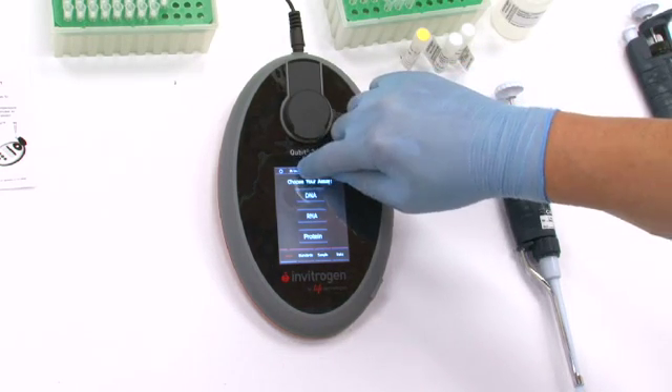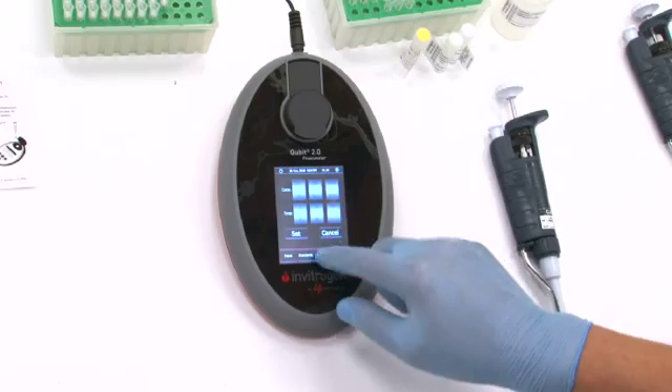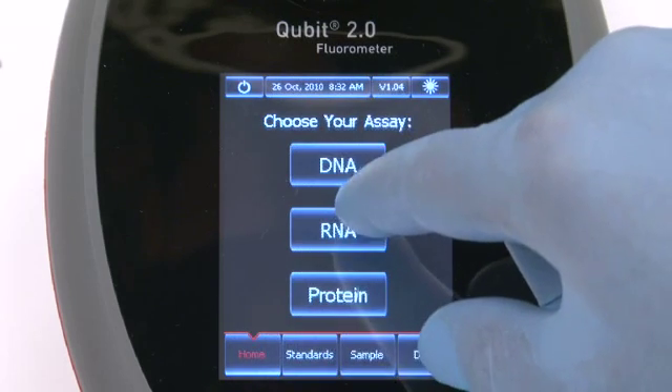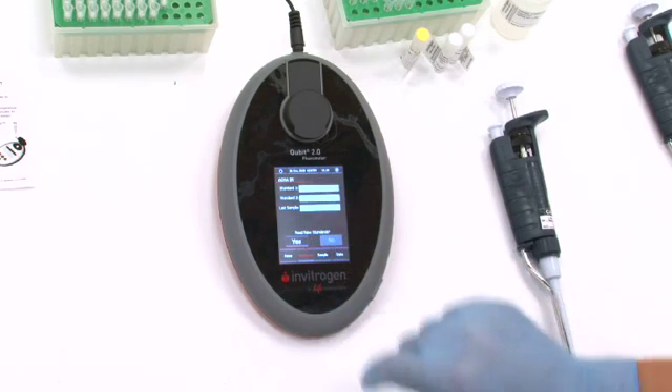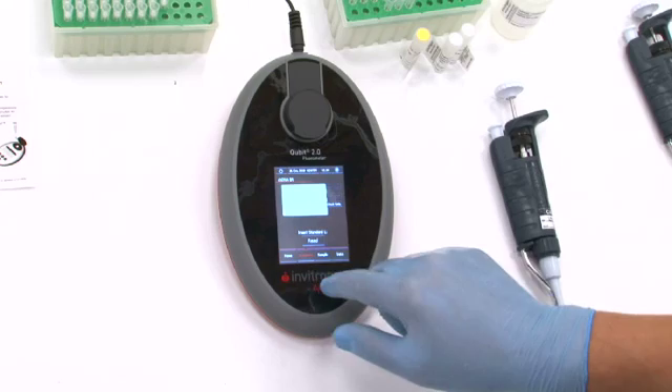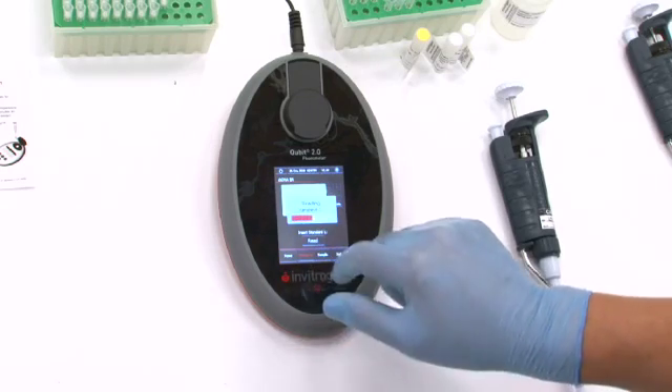Qubit 2 is simply the most specific and sensitive device amongst all nucleic acid and protein quantification devices. Much time, effort, and research money is invested to obtain precious nucleic acid and protein samples. We developed Qubit 2 because we believe that knowing precisely and accurately the quantity of DNA, RNA, or protein is so critical for the success of downstream applications like sequencing, PCR, RT-PCR, transfection, and immunoassays. The device provides trust and confidence, ensuring downstream applications don't suffer from inaccurate quantification.